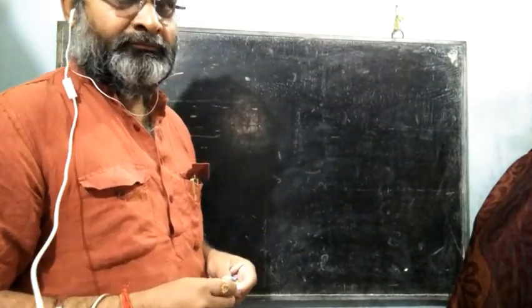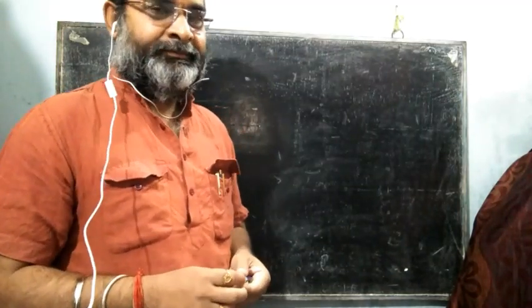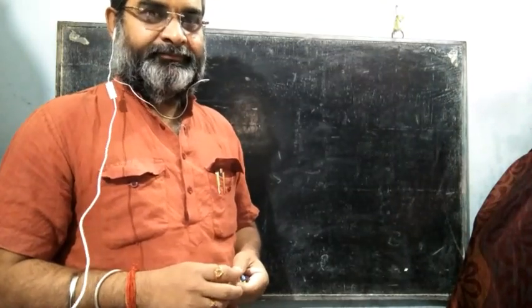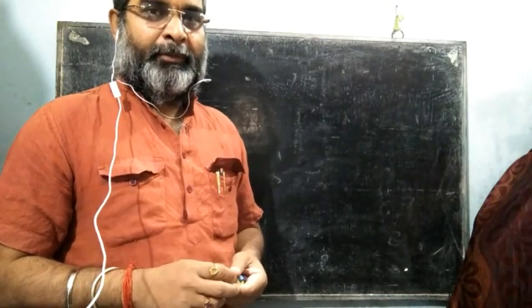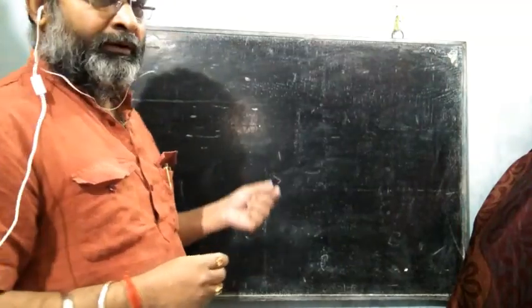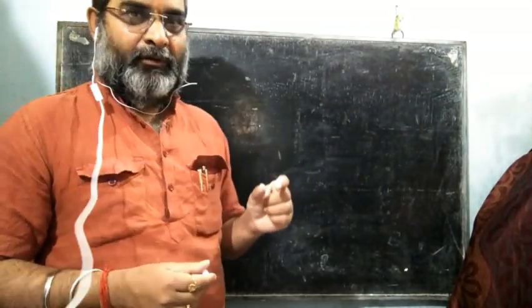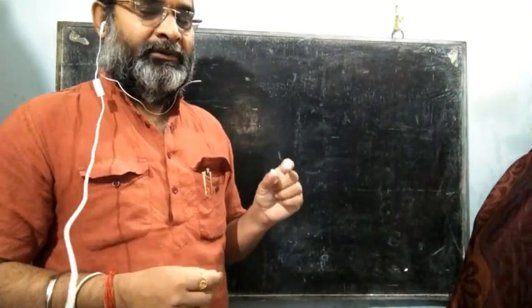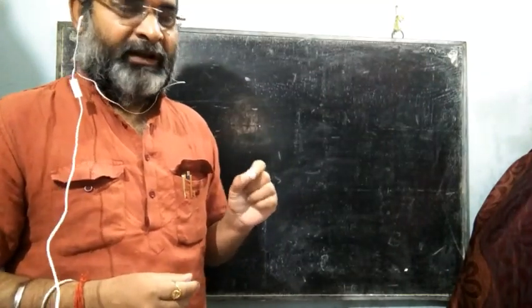bands of the previous class again, because some students communicated to me that they have no proper understanding of the analysis of the data. So again I am revising only the data analysis part, the analysis of the banding pattern of the last class.